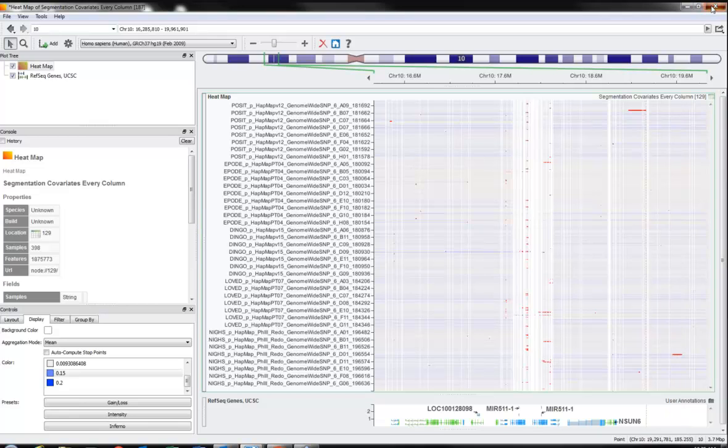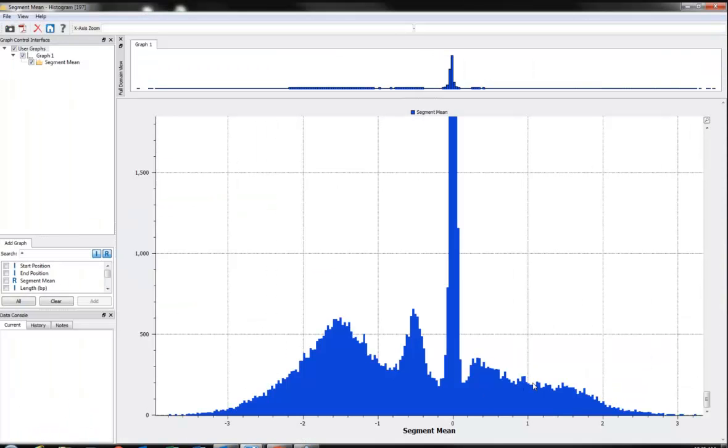The reason I'm emphasizing this so much is if you come back and look at these average values within segments, a lot of other algorithms that are out there for classifying copy number changes focus heavily on the expected distribution within each copy number classification. They'll have some kind of heuristic model that says if the average is negative 0.5, and maybe compare it to allele frequencies or whatever to try and make a guess, but there's always some uncertainty with most platforms. Some platforms are better than others at really distinguishing the difference here. A lot of it has to do with what kind of normalization methods are used, but we have found that there's a lot of room for error when you try to make an absolute classification. But if you have large sample sizes in a GWAS situation, just focusing on the intensity change will generally still point you in the right direction.